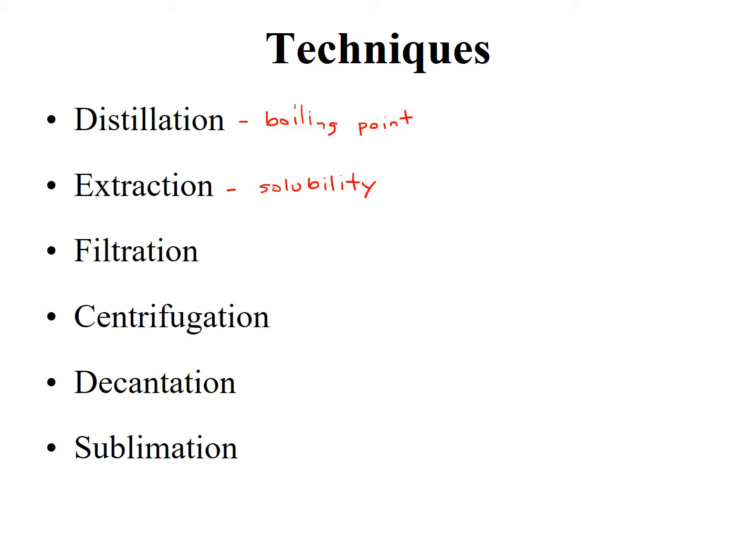You have a mixture that contains a water soluble and a water insoluble component. When you put them in water, the one that remains undissolved is the water insoluble. The one that dissolves is water soluble. Once you do that, you can separate them using the next technique.